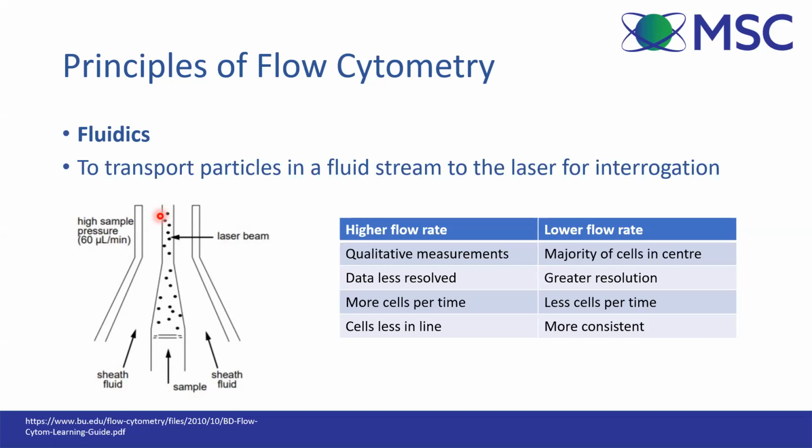Of course, there are other methods of getting a stream of single cells through the laser, like acoustic focusing. I won't go into that today, but there are cytometers that use acoustic focusing as well.